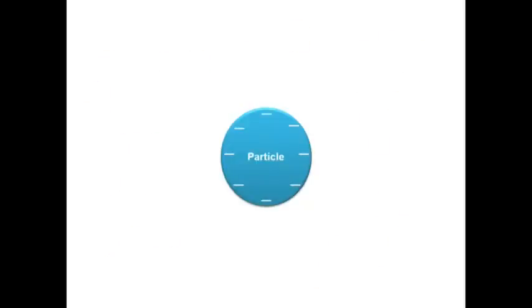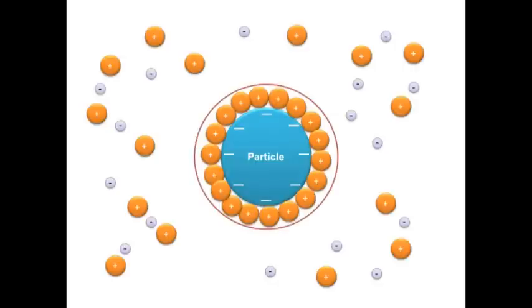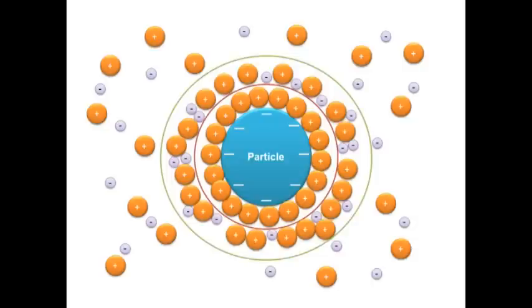The surface charge of the particle is negative. The layer of positively charged particles around the negatively charged surface is named the Stern layer. Then, a diffuse layer composed of ions of opposite polarities encapsulates the first. These ions are free to move due to the influence of electric attraction and thermal motion rather than being firmly anchored. Combined, these make the electrical double layer.